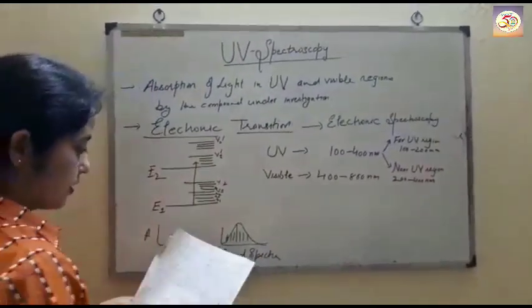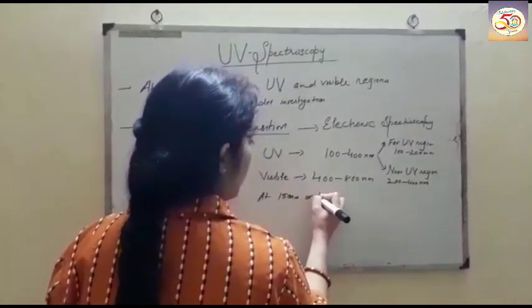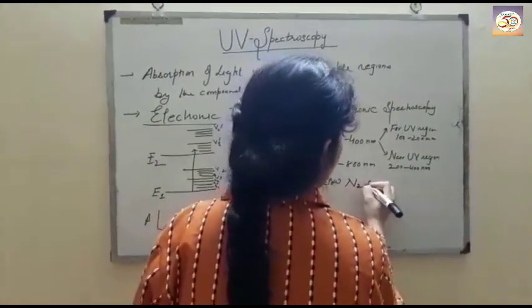However, at 150 nanometer or below, nitrogen starts absorbing.